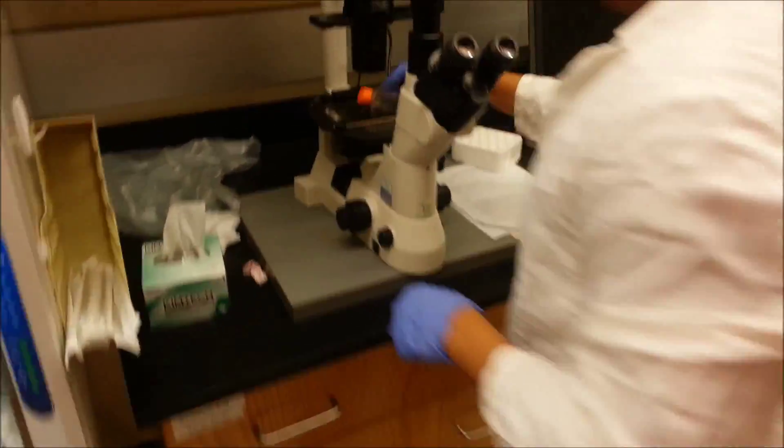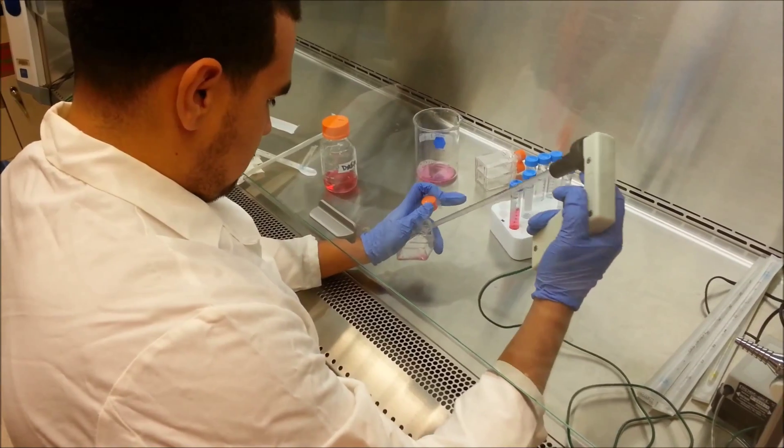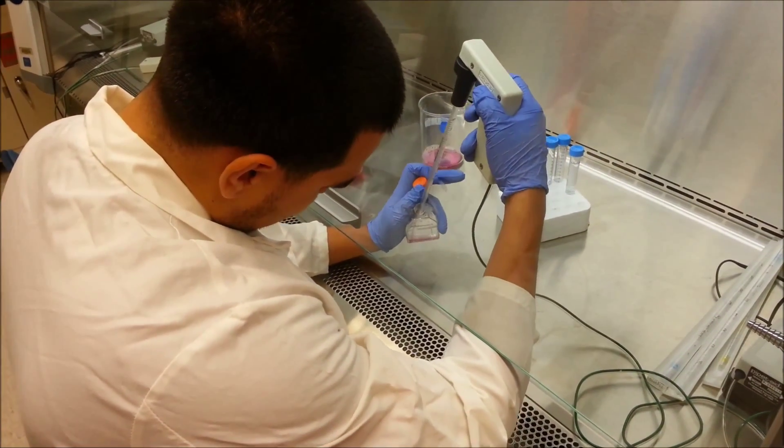Take the flask to an inverted microscope and watch them. Once they start to appear round, remove most of the trypsin.